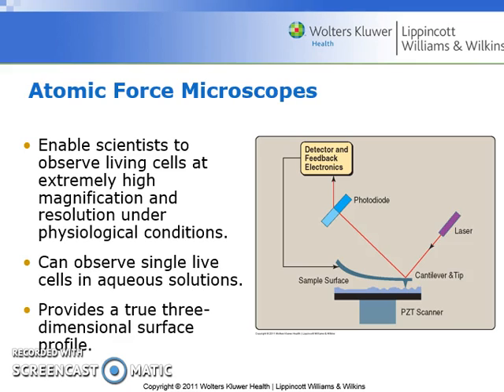So you have this aqueous solution, you have your microbes inside of there, and so you're able to see microbes interacting with each other, you're able to see protists interacting with each other. You're able to observe all of the interactions that occur between these viable organisms in real time. Which is really great because we like to see how certain cells interact with each other.